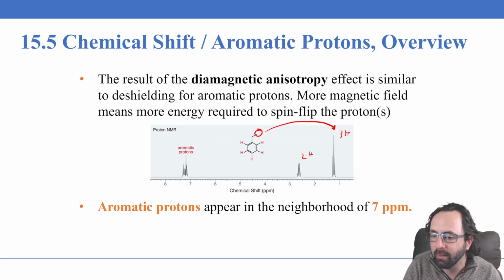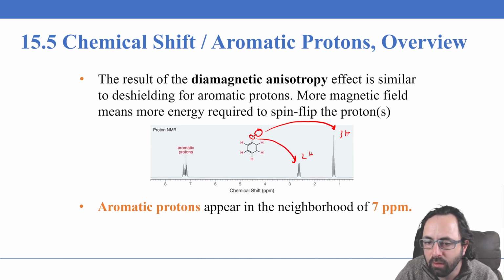You can see that it's not really chemically shifted much at all, maybe just a little bit, because it's 2 carbons away from the benzene ring. Whereas you do have some significant shifting on these hydrogens attached to this carbon, which are represented by these peaks right here.